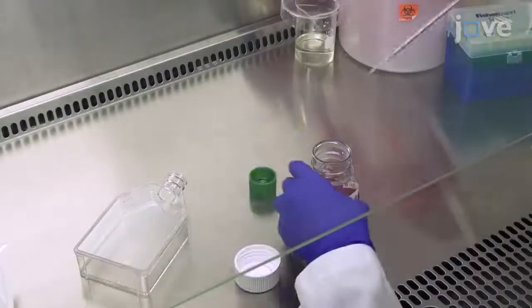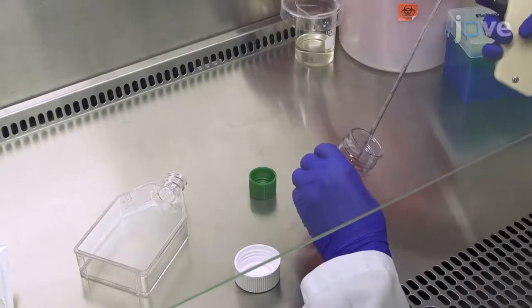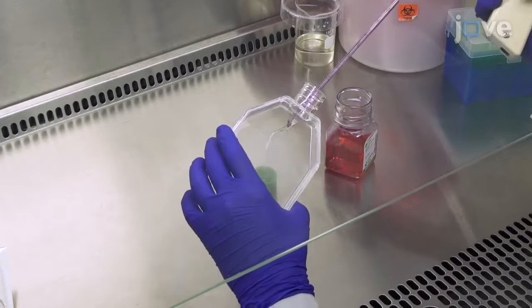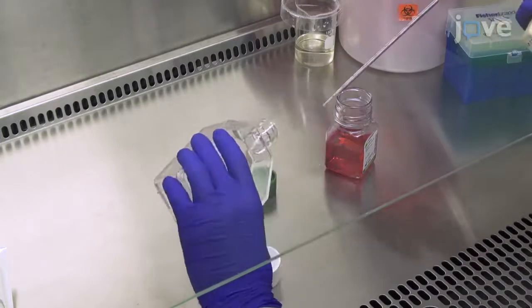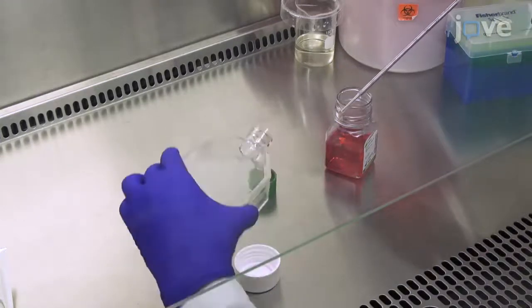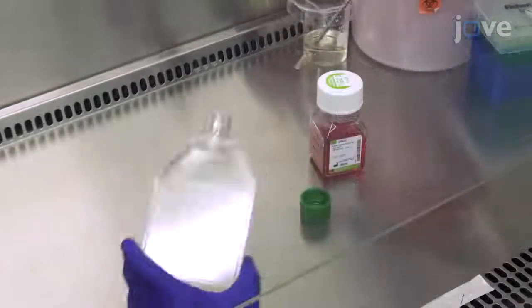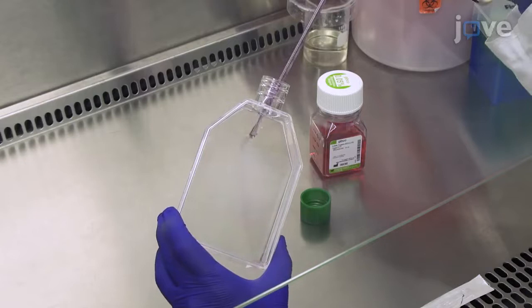One day before cell stimulation, remove the growth media of HeLa 57A cells that have been grown to about 75% confluency. Wash cells with 1 milliliter of 0.05% trypsin EDTA. Replace with another milliliter of trypsin EDTA.